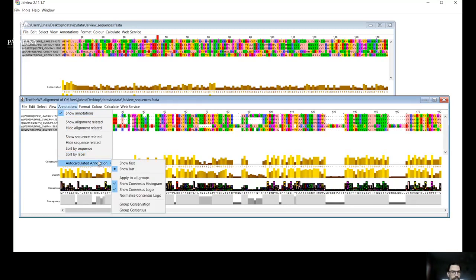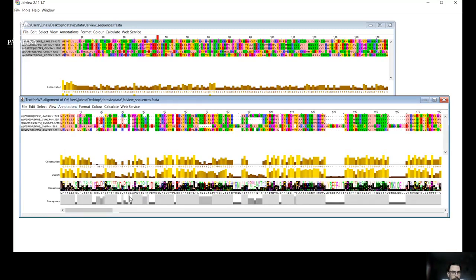You can also make it normalized, where the letters are written bigger. So for example, here if you move your cursor here, you see all the letters, but they also have a bit bigger size, so maybe they are a bit more readable. So in the sequence logo plot, all the possible amino acids in a position appear.